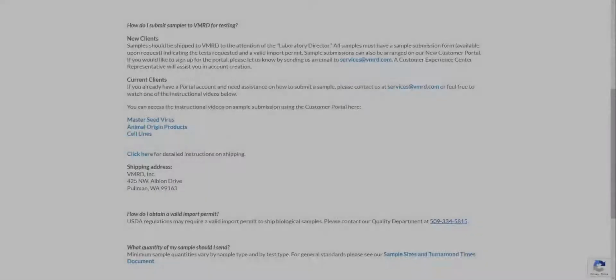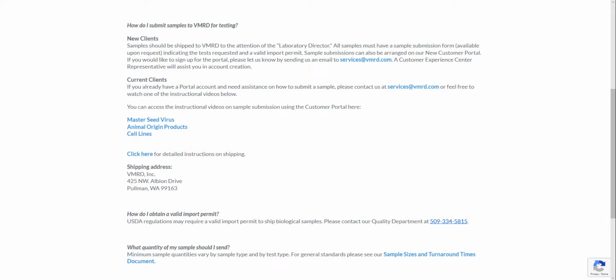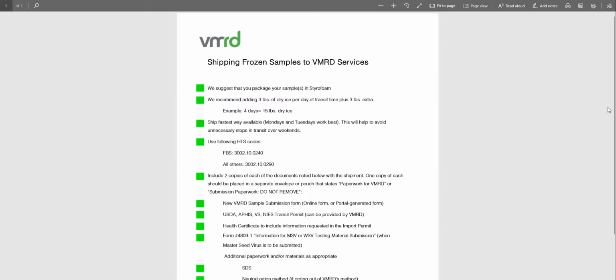So that's it, the whole submission process. Now you can package and ship your sample to our facility. For a shipping checklist, refer to our website at the link provided in the video description below.